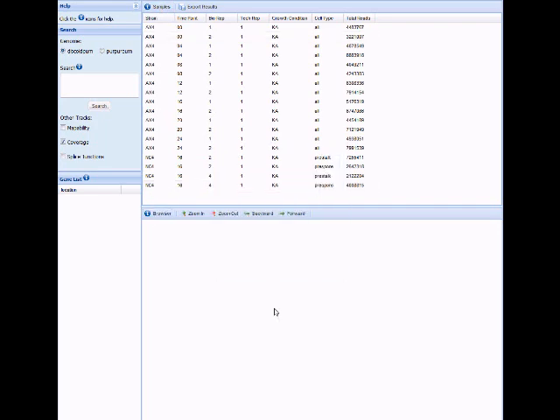To start using this tool, you search for gene regions of interest. You can do this by gene name, gene ID, chromosome location, and you can also use the wildcard.